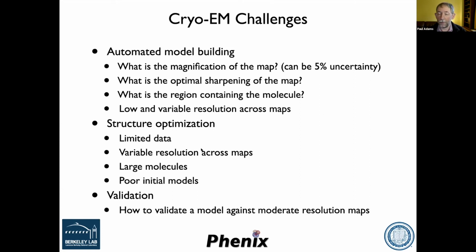Sometimes the starting models are quite a long way away from the answer because they might be homology models even. You might not even know exactly what is there in the map or in the volume. And then there are still questions about how to validate the models against these maps. And there are some open questions about validating the maps themselves.